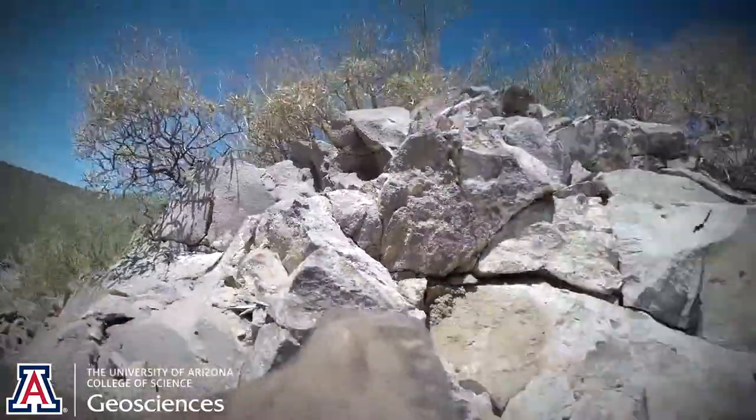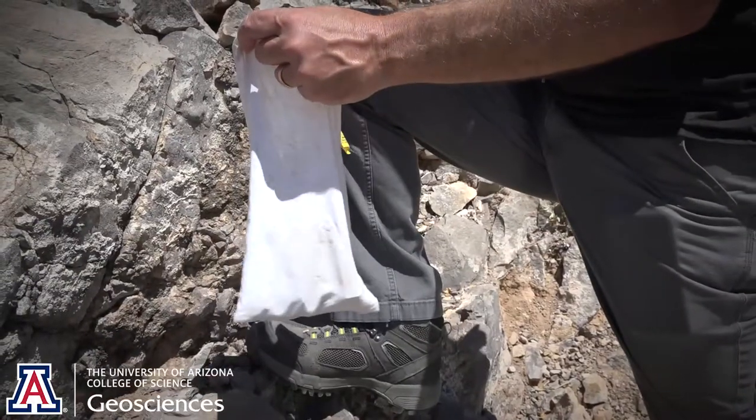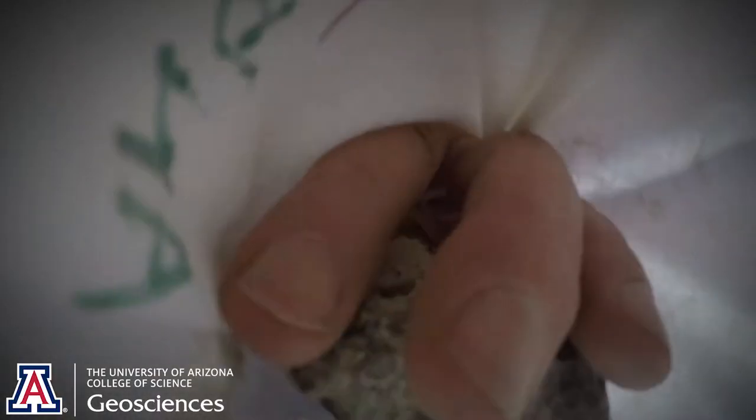So this is a rhyolite, so it's going to be pretty rich in zircon. The key is we're going to fill up a small bag like this, and just remember no rocks bigger than the size of your fist. That's it — last rock. Let's go get an age.